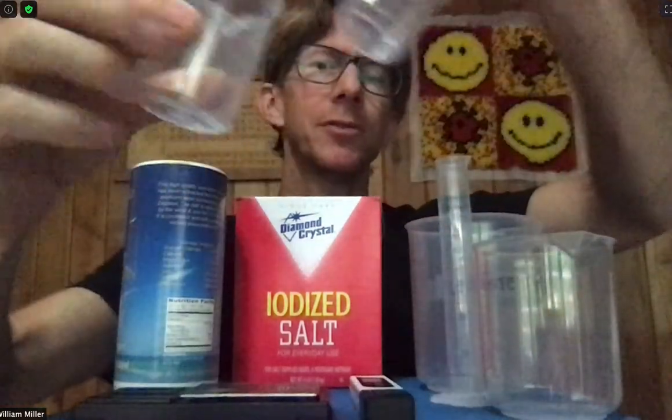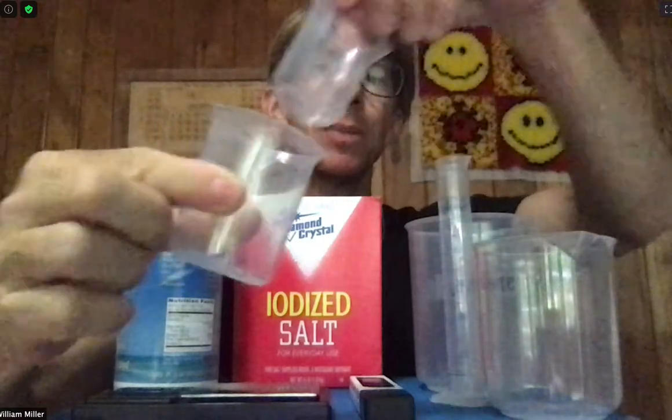I've also got my 50 and 100 milliliter plastic beakers. I've got my 500 milliliter plastic beaker — this is going to be used to hold my 400 milliliters of distilled water. I've got my waste beaker.